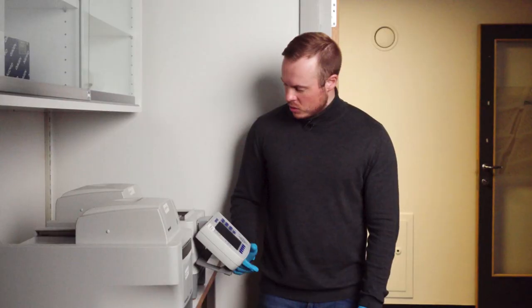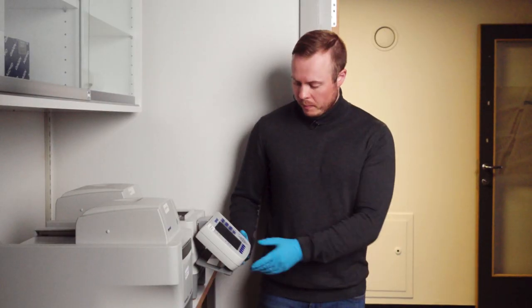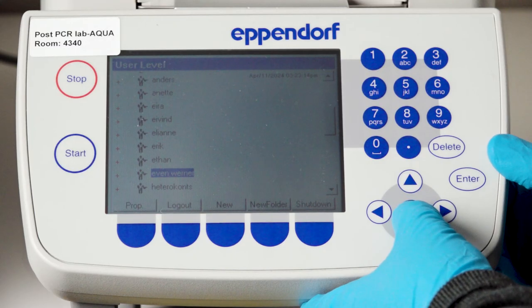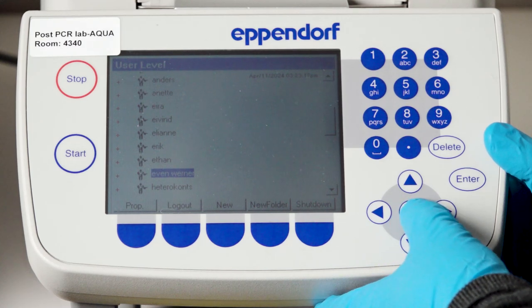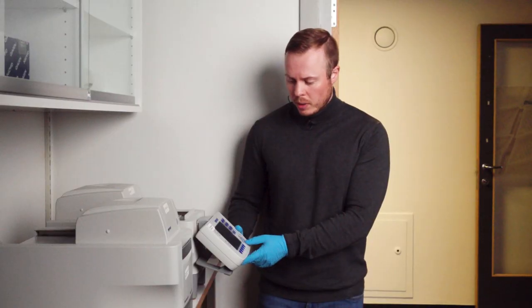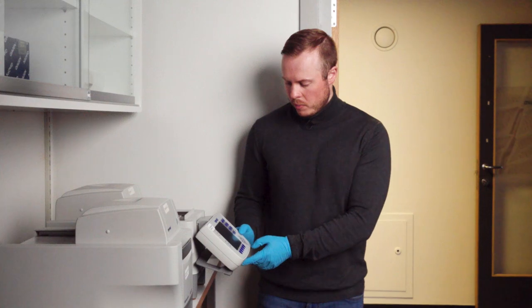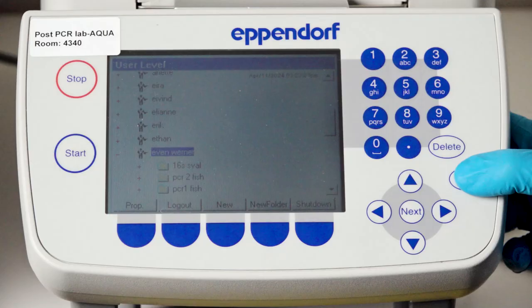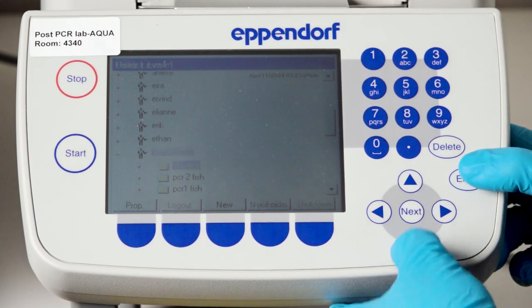This is bacteria so I need a bacterial PCR 1 program, and it's very important that you adapt the program you use to the primers you need. So I push enter, then I get up my folders.